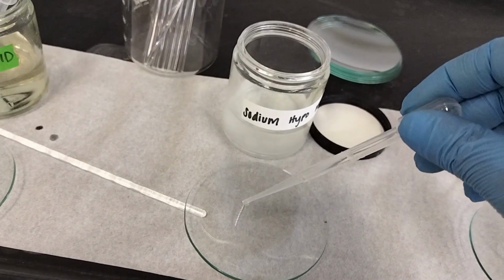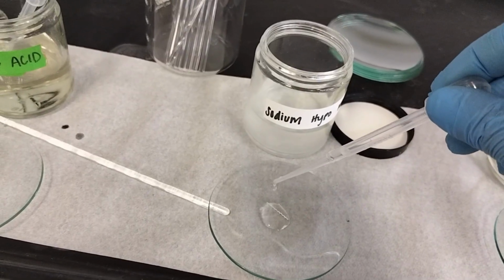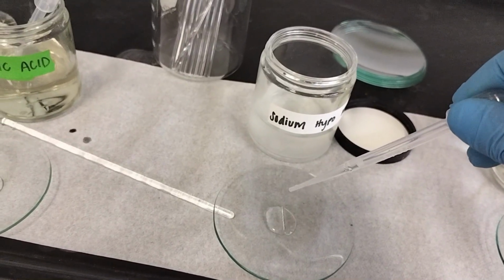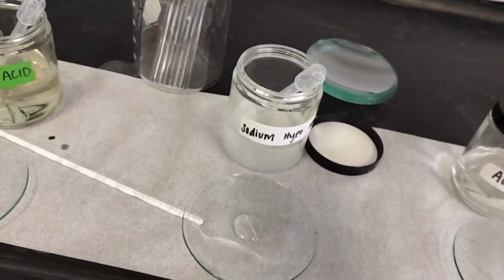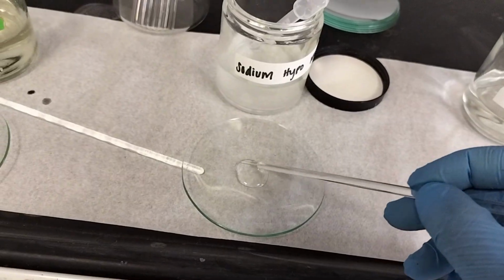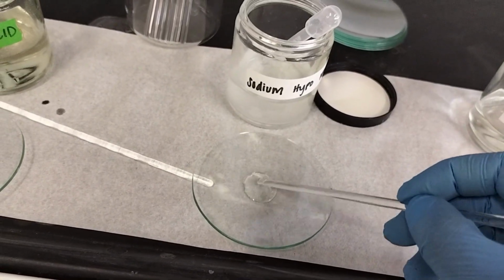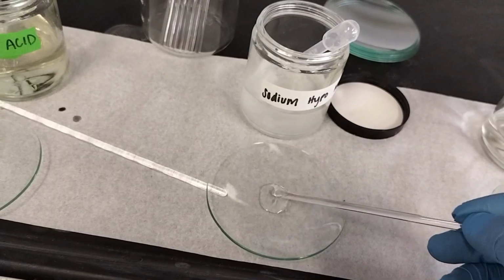This is sodium hypochlorite. I'm now going to place the wool fiber sample into the sodium hypochlorite and observe the reaction. Let's see what happens when the fiber comes into contact with the chemical, sodium hypochlorite.